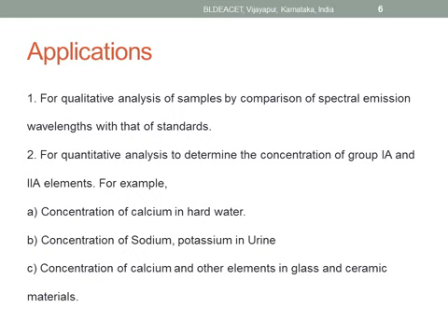Okay, this is about the theory, instrumentation and applications of flame photometry.